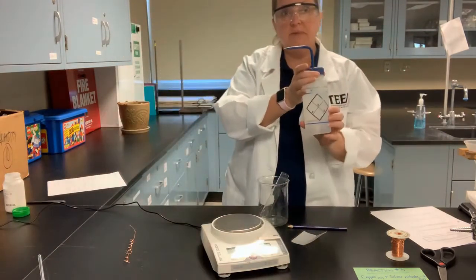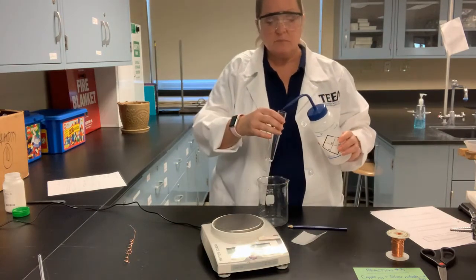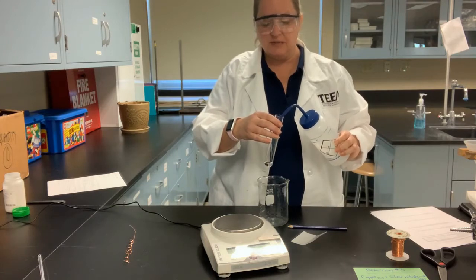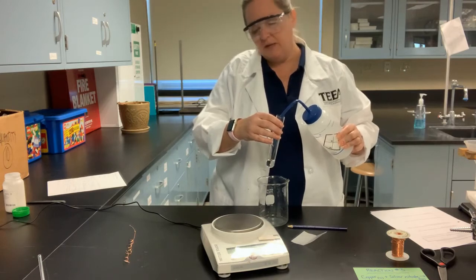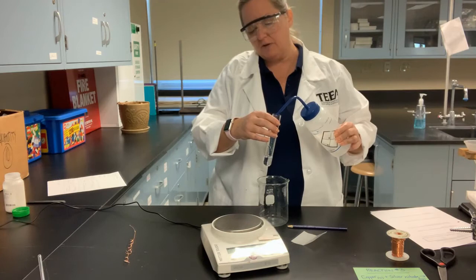And then the next step is to add deionized water, and that's what's going to create our aqueous solution. So I don't need to measure my water because it's simply a vehicle for the reaction to take place. I just want to add enough that I fill the test tube at least 3/4 of the way full and add plenty enough water for the silver nitrate to completely dissolve.